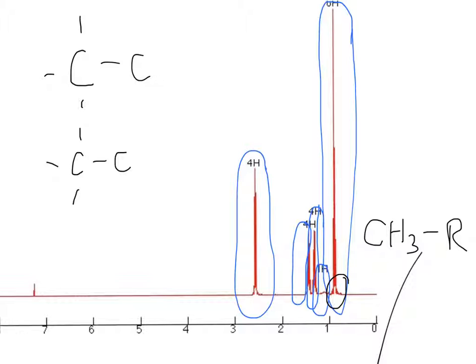One of the main other things that I noticed is that there is a shift right there that only has 1 hydrogen. And from what we gathered from the mass spec and the IR, we know that somewhere in this molecule there's going to be a nitrogen bonded to a hydrogen. So we know that that 1 hydrogen noted in this proton NMR will probably belong to the nitrogen.